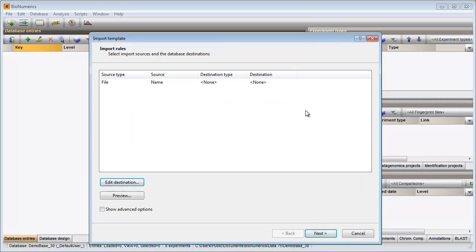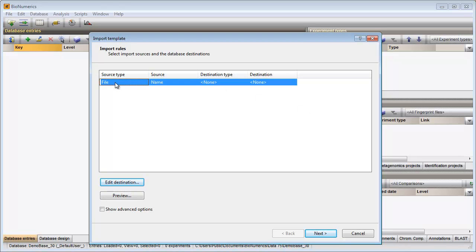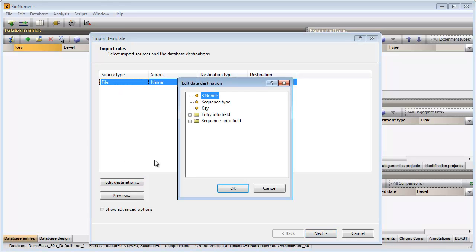The only source of information available in the newly created import is the file name. I will link the file name to the BioNumerics key field. I select the row in the grid, click on Edit destination and select the key field.